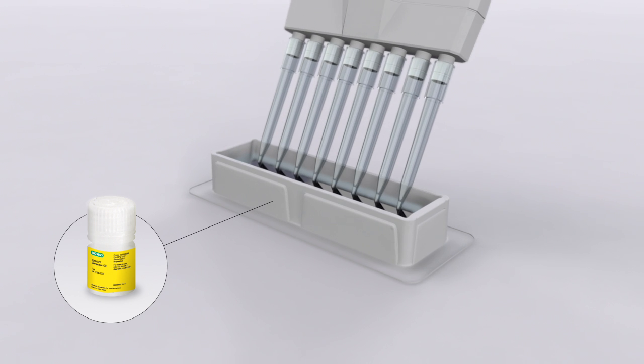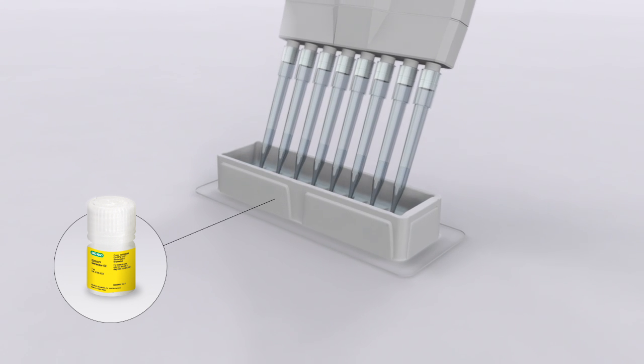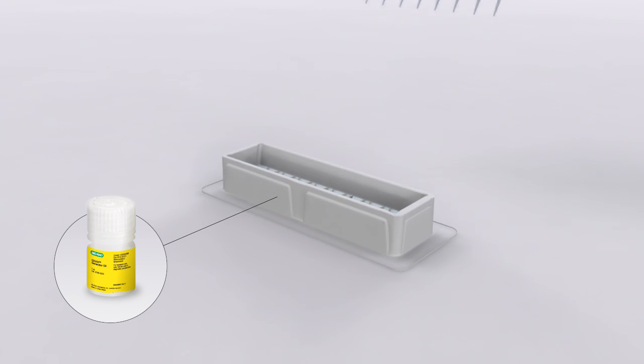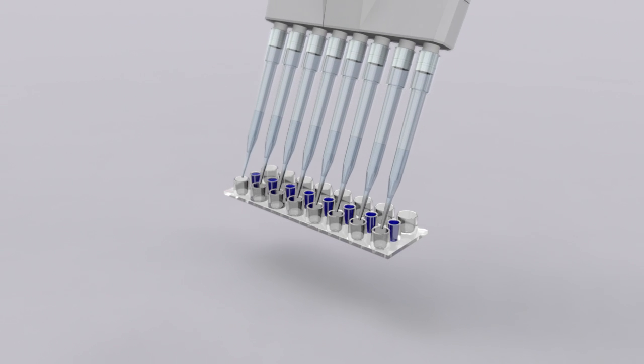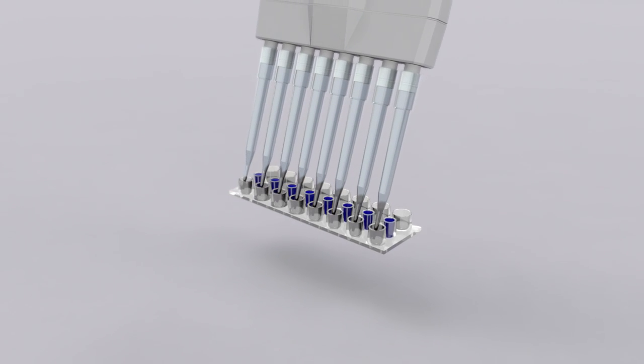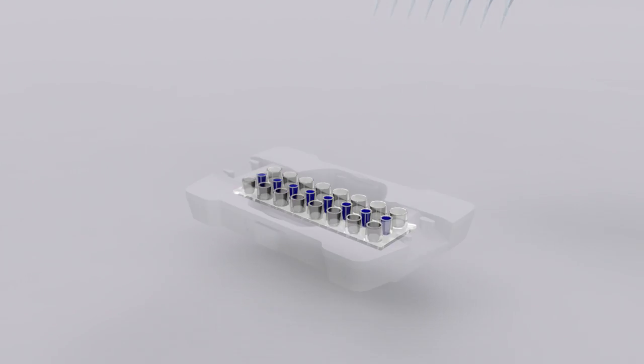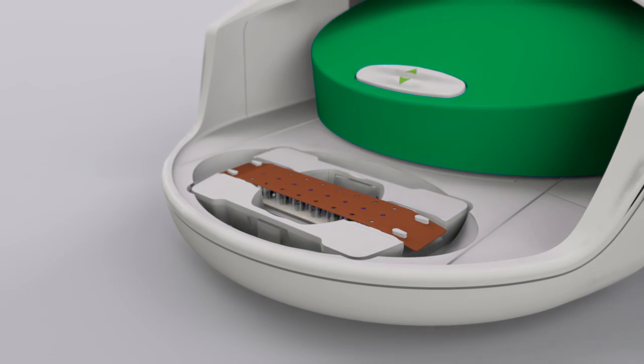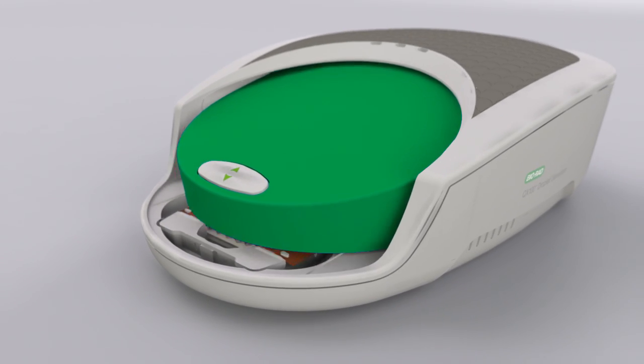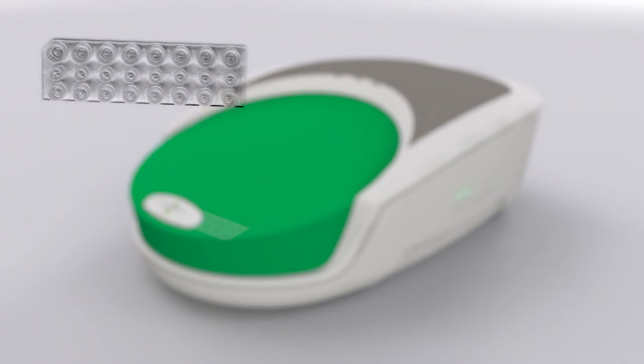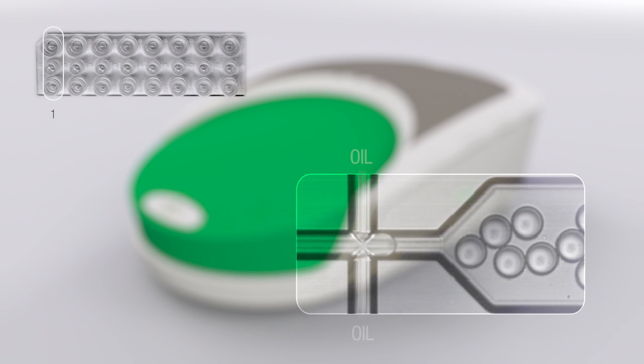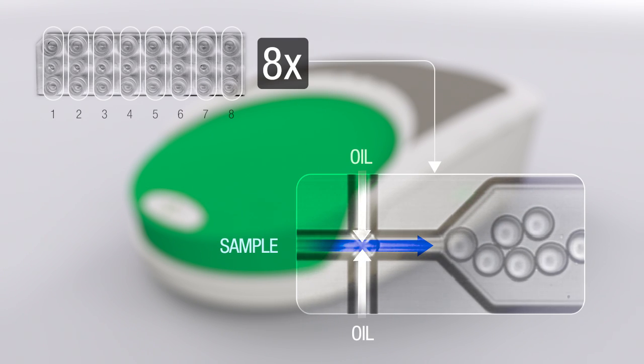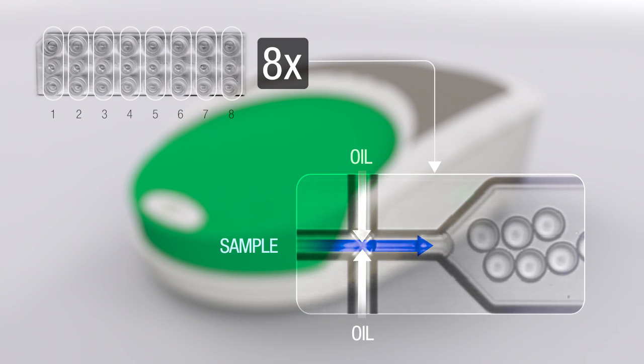Droplet generation oil is then loaded into corresponding channels in the cartridge. There are 8 oil channels, one for each of the samples. Once the cartridge is loaded with prepared samples and oil, it is placed in the QX200 droplet generator. Using microfluidic technology, the droplet generator combines the samples and oil to create an emulsion of approximately 20,000 mono-sized droplets for each sample.